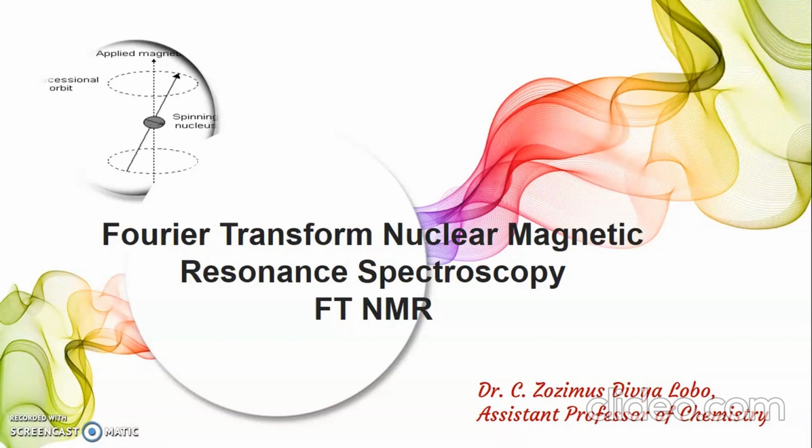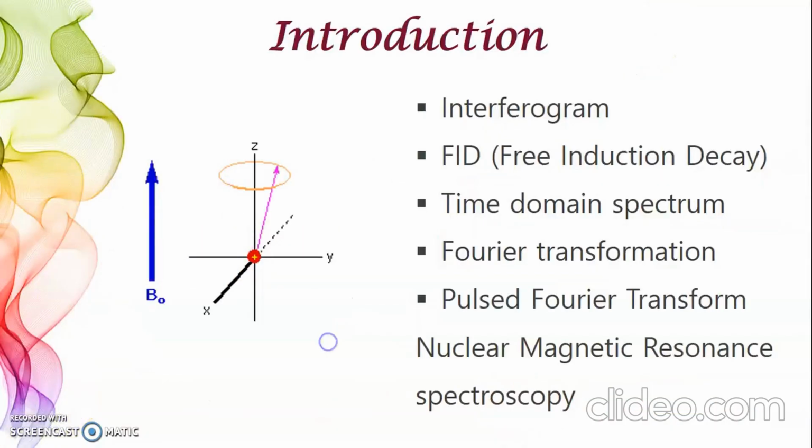Shall we learn about FTNMR, that is Fourier Transform Nuclear Magnetic Resonance Spectroscopy? We see the introduction of FTNMR spectra.